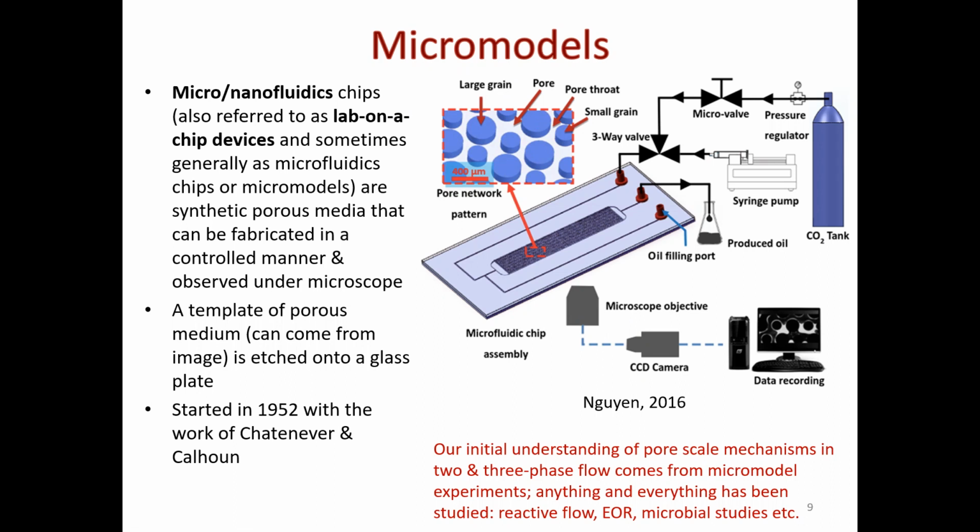Most often here, I will have what's called a microfluidic chip. Within that chip, what you do is you take a glass and then you etch it with acid. The longer you expose it, the acid will etch deeper into the glass. Whatever it is that you want to etch, you create a mask. And then the acid will react with only the non-masked portions, and not react with the masked ones. And the shape of the masked regions gives you the shape of your little columns.